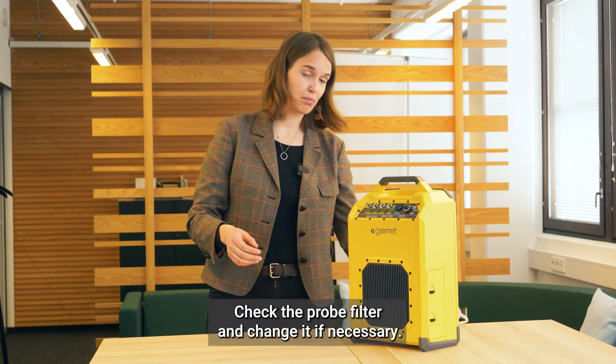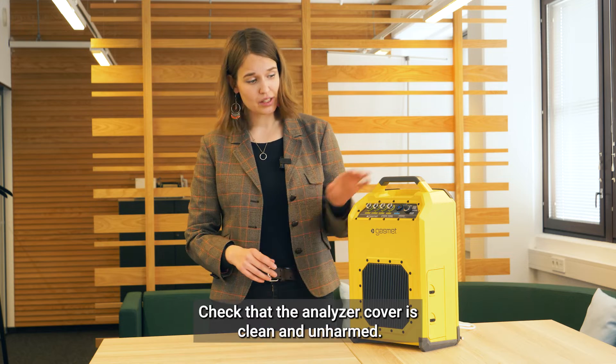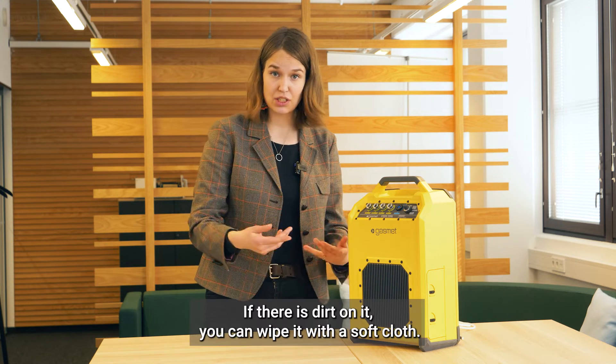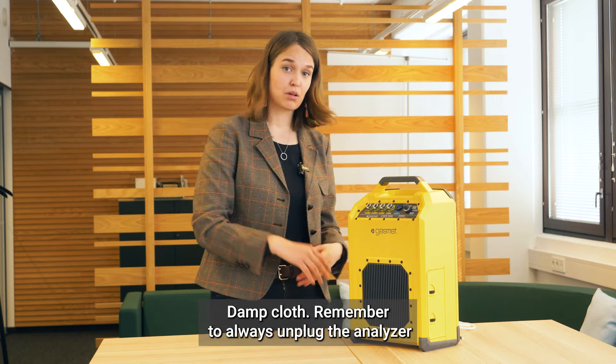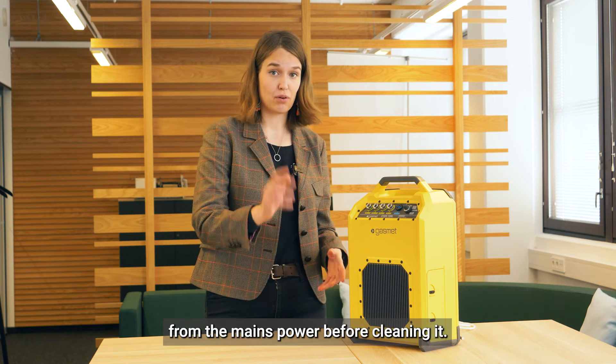Check the probe filter and change it if necessary. Check that the analyzer cover is clean and unharmed. If there is dirt on it, you can wipe it with a soft, damp cloth. Remember to always unplug the analyzer from the mains power before cleaning it.